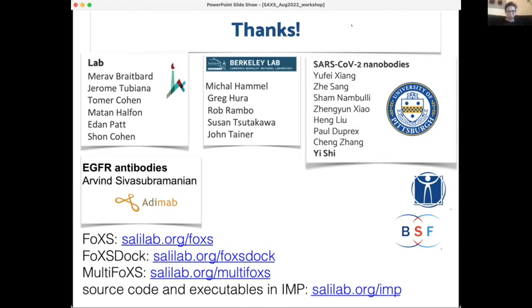I want to give you one more link. If you want to use docking with nanobodies and SAXS, I have a notebook. I'll put a link in Zoom here so that you can go over and use it. This notebook has an example of docking with the SAXS profile, and you can always open it, change it to your proteins, your PDBs, your data, and try it. It has all the different programs inside, so it brings them for you and you can run it.